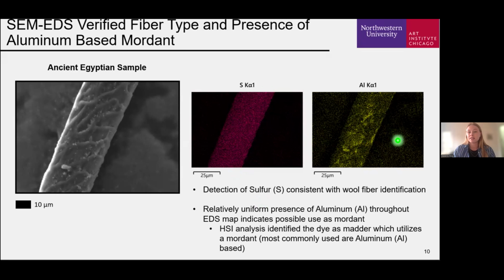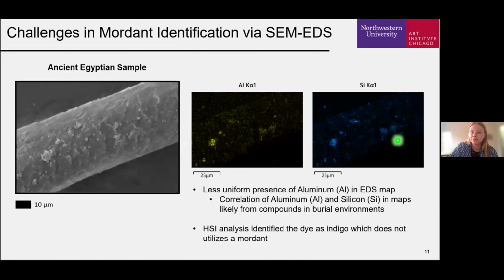In EDS mapping, the uniform distribution of sulfur was consistent with the fiber identification of wool discussed previously, and the presence of aluminum relatively conformal across the mapped region, combined with hyperspectral imaging analysis identifying the dye present as madder, indicated an aluminum mordant was likely utilized in this sample.